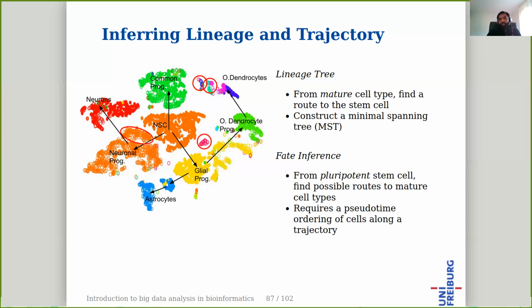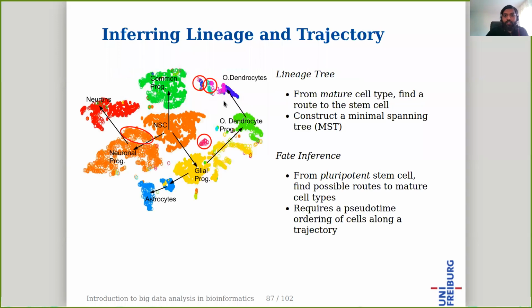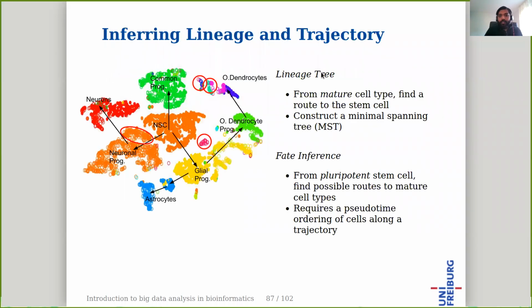And there are methods to do this. Let's first look at how to generate the lineage tree. So we are looking at this part here.